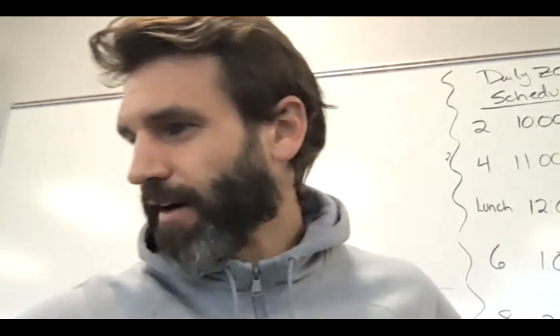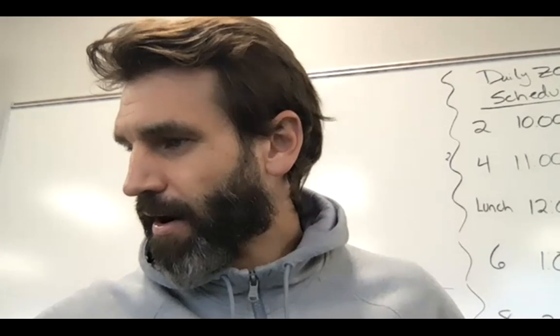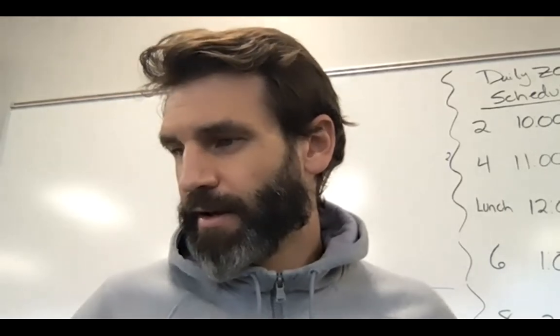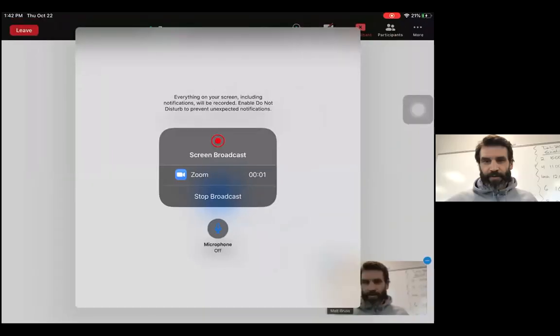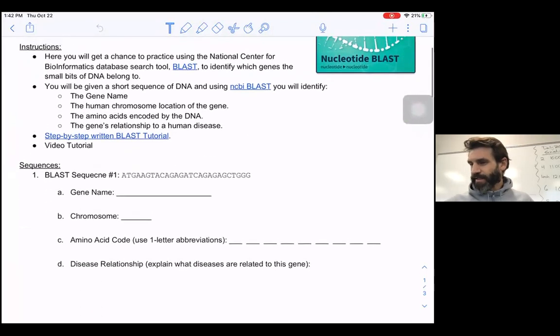I'm going to go over here and do it on the iPad because I think a lot of you might be doing this on your iPad. All right, so here we are. I've already pulled up this assignment in Notability, and I'm going to try this first sequence here, BLAST sequence number 1.